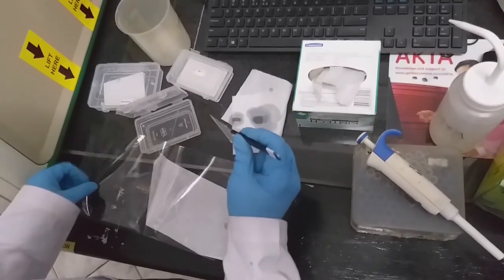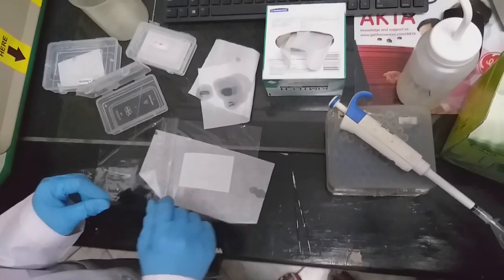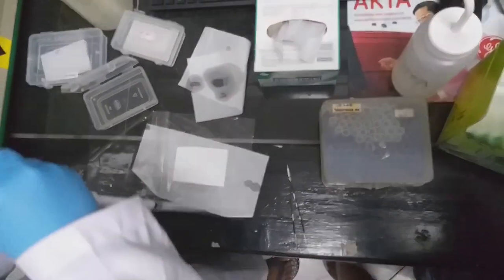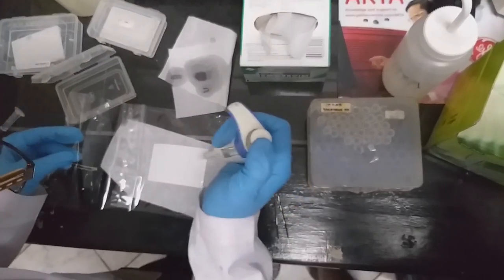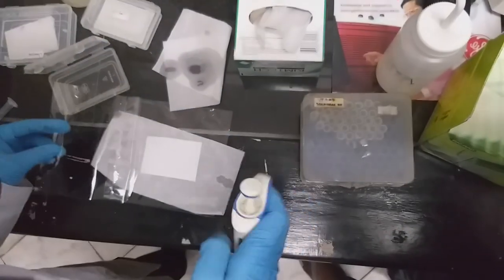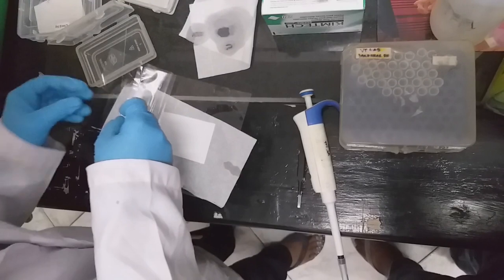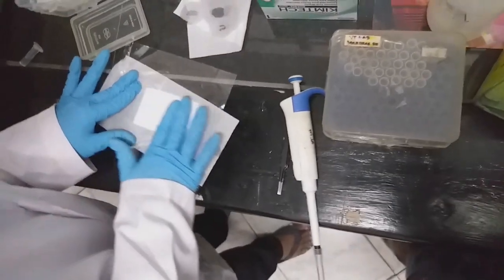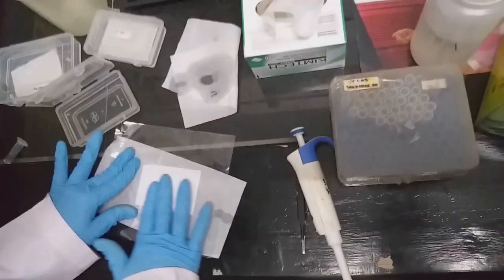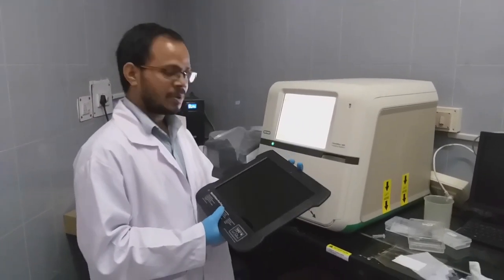After that you keep the blot in between plastic paper foils. Then we will take the chemiluminescent substrate. After that, we have to slowly press and remove air bubbles. This is the tray we use for developing the blot.